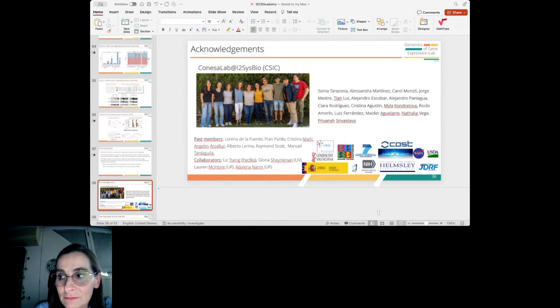I think at present, one way to go is to use orthogonal data. For example, if you use CAGE data, you can resolve some of these problems in detecting transcription start sites, which is one of the major issues today. But yes, I think that is more a question of the library preparation than of the sequencing platform.